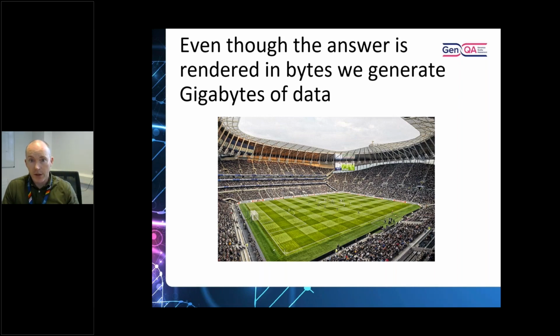We've only 4 things we can measure, and we're not always the most accurate in those measurements. Then we have to put those into strings, and we see where we think in the genome those strings belong. So we end up generating a lot of data. When we have figured that out, and we think there's a change from a C to a T at this particular position, then the work of the geneticists, the variant classification, begins. But we're not even going to talk about the variant classification, because that's, from a data perspective, fairly small. I'll just mention it a bit at the end, but the classification isn't the big thing.